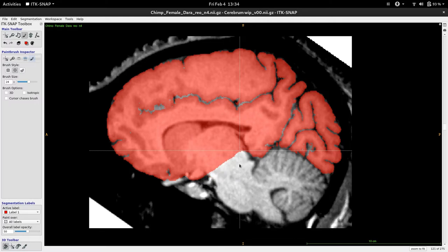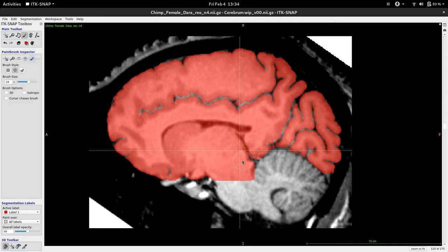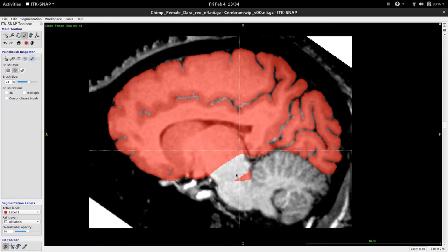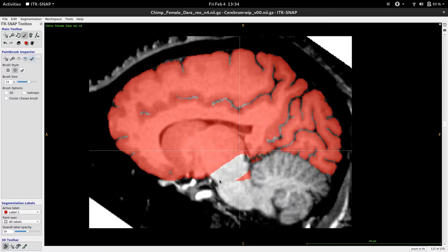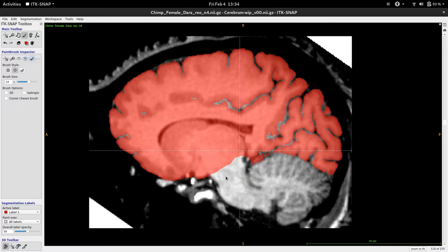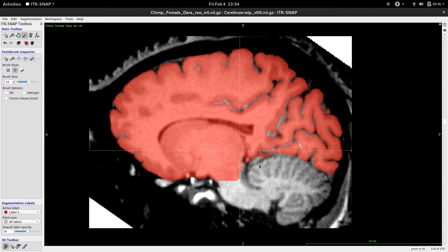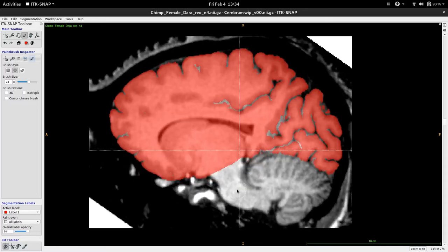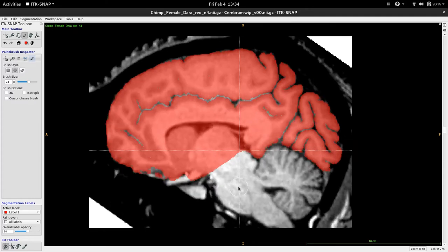It's not the best way. I didn't think too much about it, but at least it is better than not paying any attention. I'm not moving my hand too much around. A bit of extra cerebellum, I can remove it. Okay, now this is enough, I can go back.